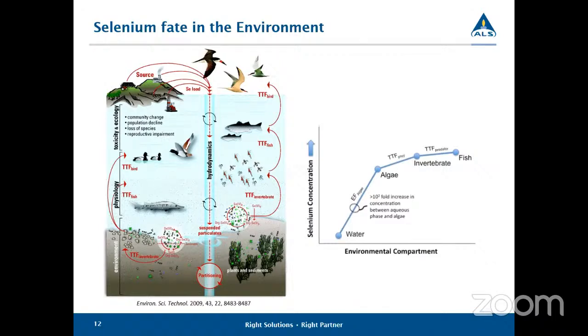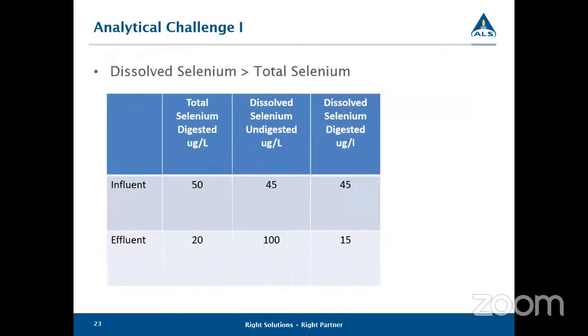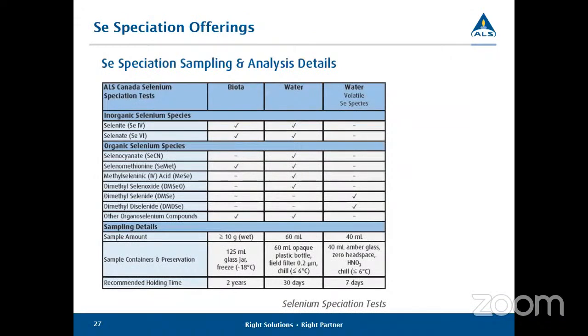Okay, and our final question: I saw an amount of tissue required is 10 grams for analysis. Is this the optimal amount? What is the absolute minimum that you might be able to work with? Yeah, that's an optimal amount to get a good homogenization, but we do have methods for total metals where we can go down to biopsy amounts. We could probably do something similar for speciation, but we might have to adjust some detection limits.